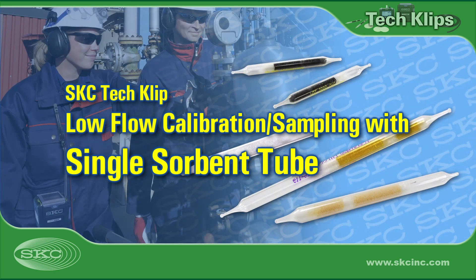Welcome to SKC Tech Clips. Today we'll show you how to calibrate sample pumps for low-flow sampling and how to sample using a single sorbent tube.